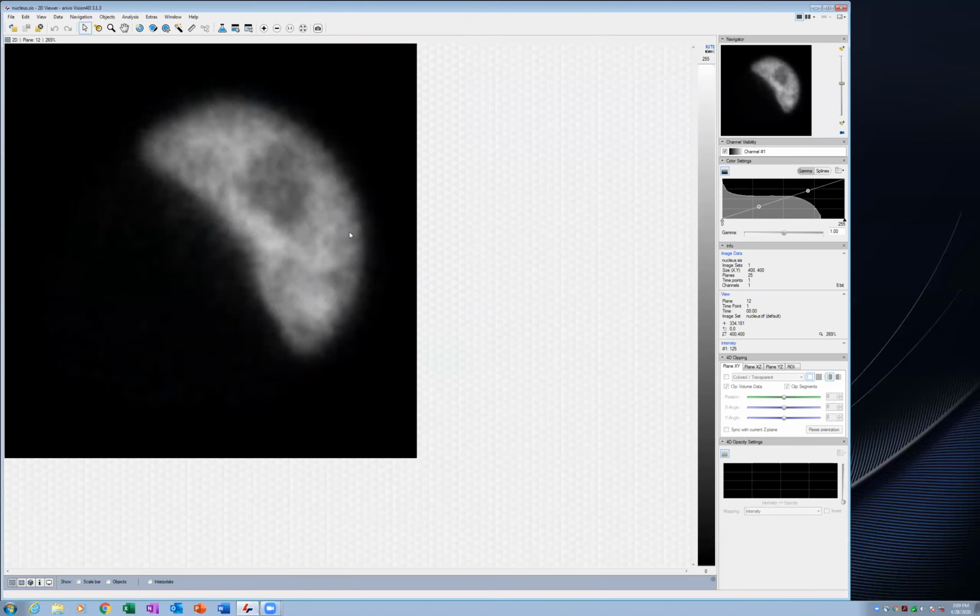Maybe not all of you are familiar with arivis, so I'll show you how you would do this normally if you're doing, say, a manual thresholding. The next thing I'll do is show you how you would do it if you're drawing and annotating it yourself. This is usually referred to as annotation, which, because I come from a pathology background, always seems bizarre to me. I think annotation is like writing stuff on the screen next to interesting objects, but this idea of manual segmentation is also referred to as annotation.